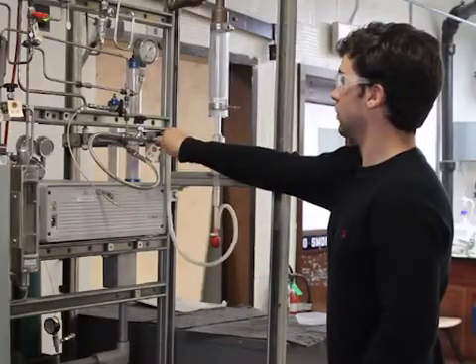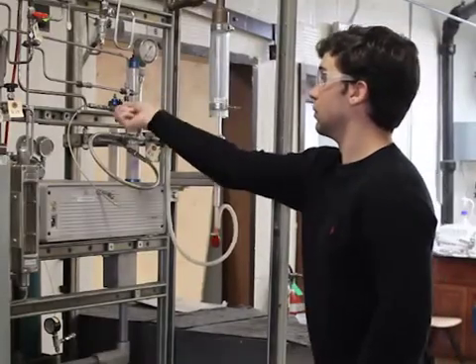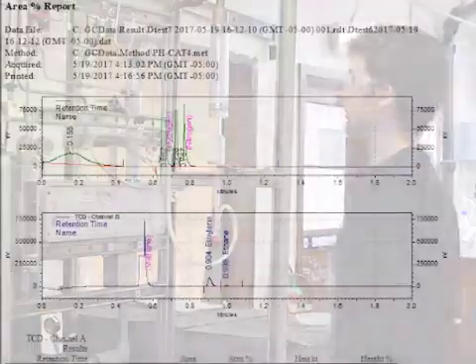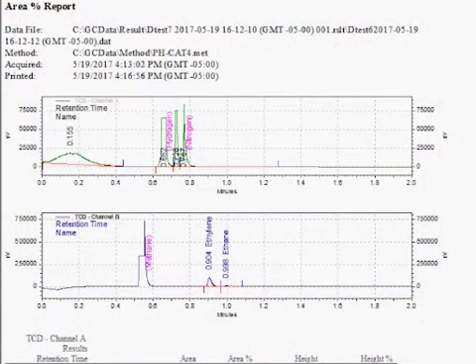Next, check the reactant composition by flowing the reactants through the reactor bypass and into the gas chromatograph inlet port.